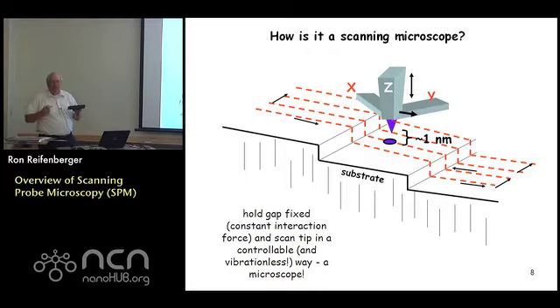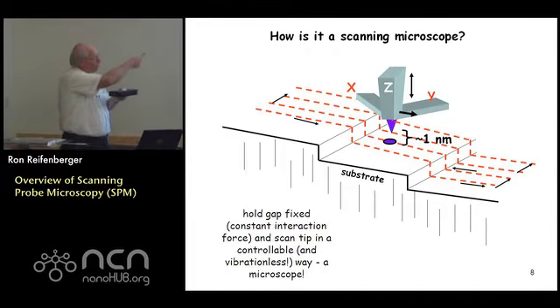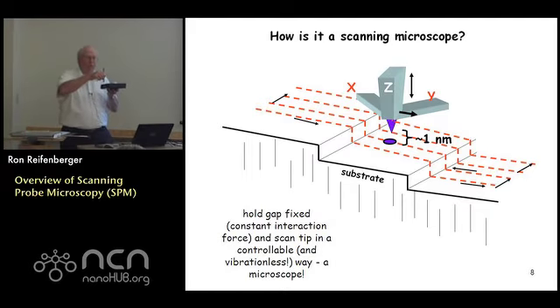What this scanning probe microscope is going to do is take a sharp tip and move that tip over the substrate in a systematic way. I've indicated a systematic way by these dashed red lines. So you basically raster the tip across the substrate, move the tip up, raster it back, move the tip, raster it back. You keep going back and forth, right?